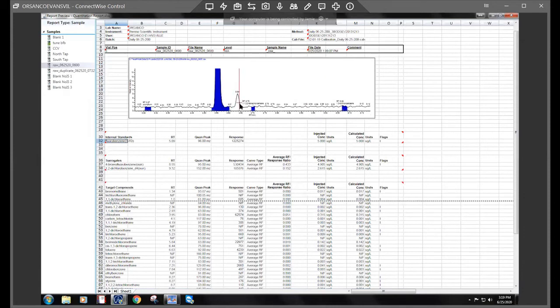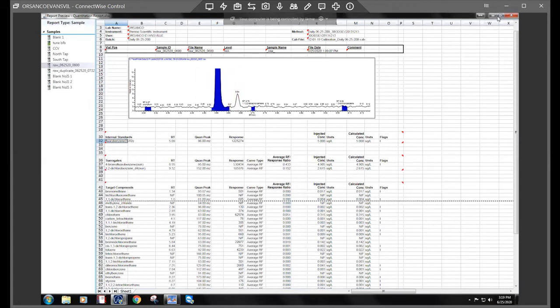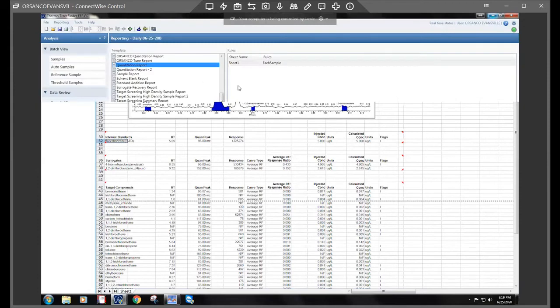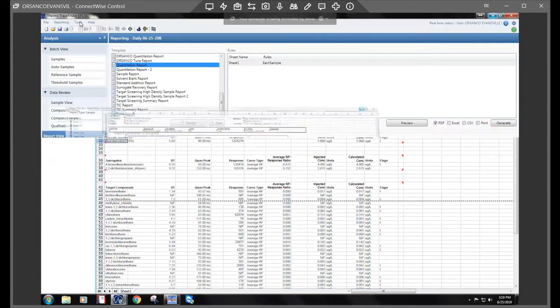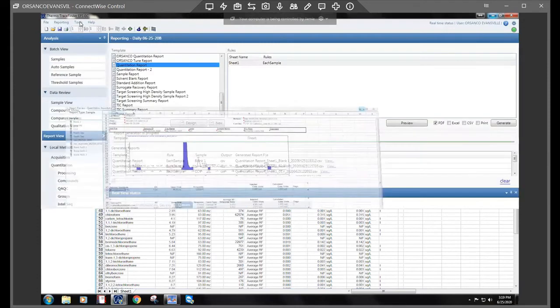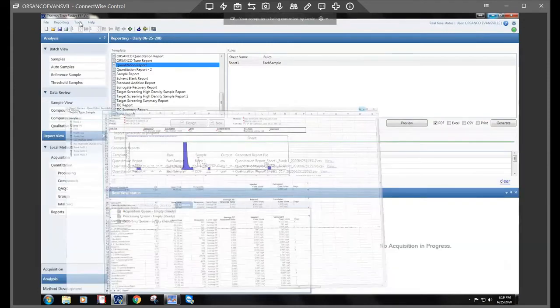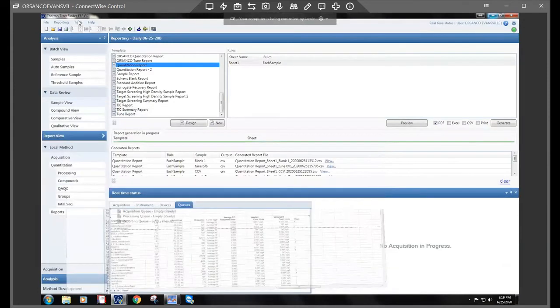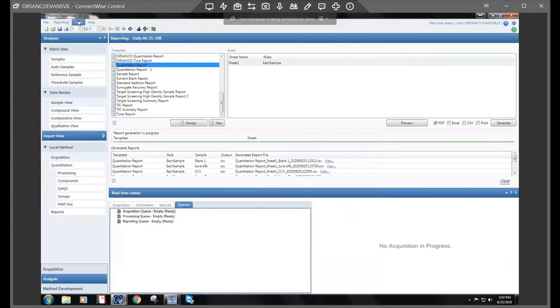So maybe we'll go investigate and see what it is. So we will do the same thing. I'm going to minimize this, go once it loads, tools, launch qual explorer.